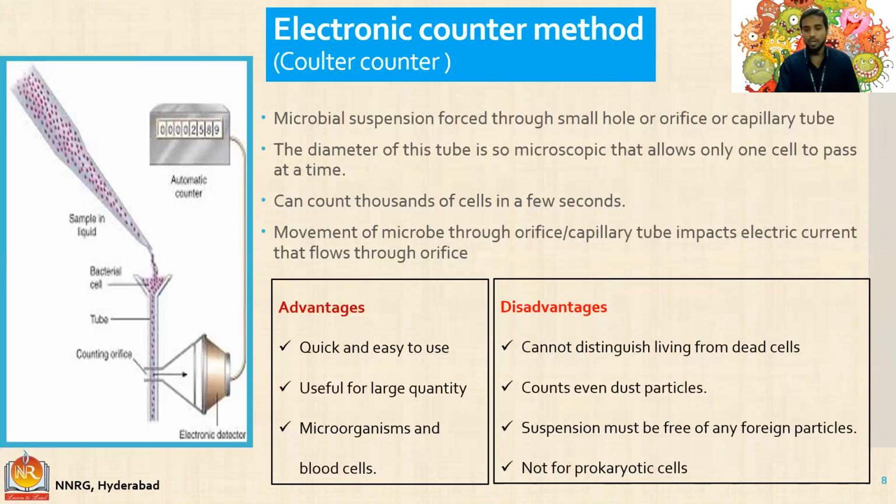And it is not for prokaryotes. Okay, this is not for bacterial cells. It could be used for any other things. Okay, if the size of the bacterial cells is a bit bigger, equivalent to RBC, then we can do that also.